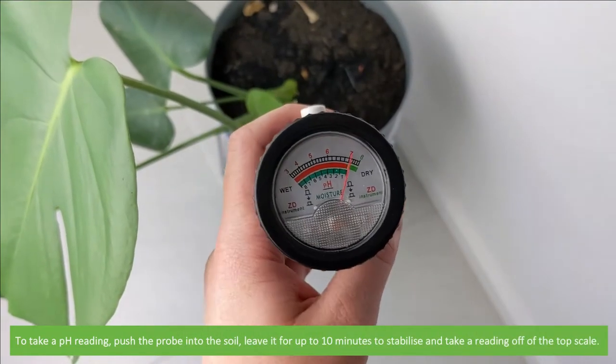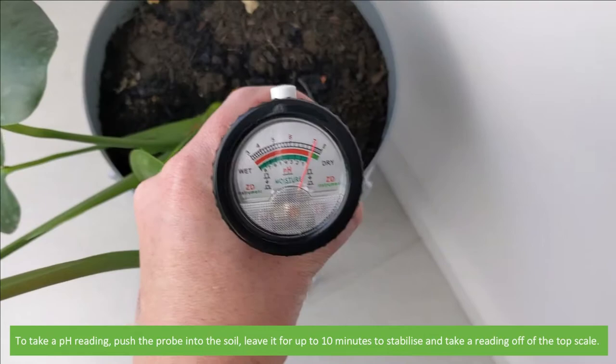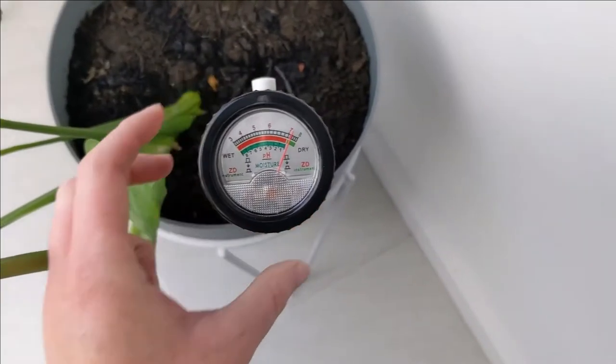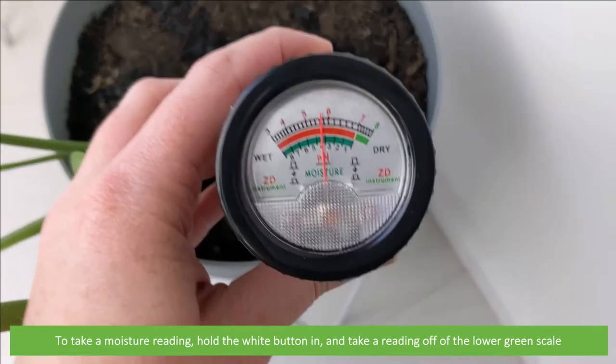To take a pH reading, push the probe into the soil, leave it for up to 10 minutes to stabilise, and take a reading off the top scale. To take a moisture reading, hold the white button in, and take a reading off the lower green scale.